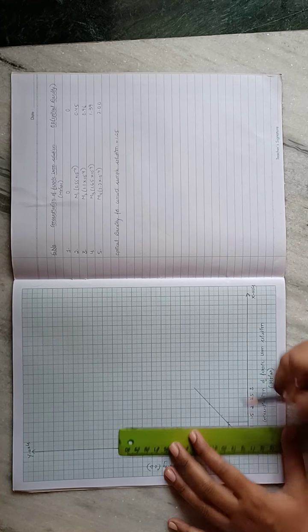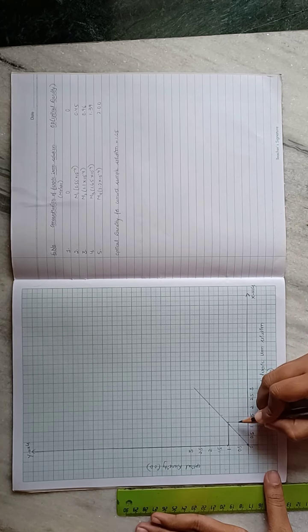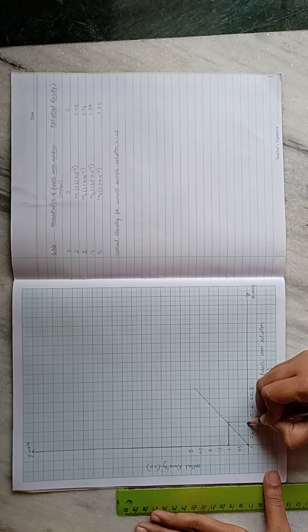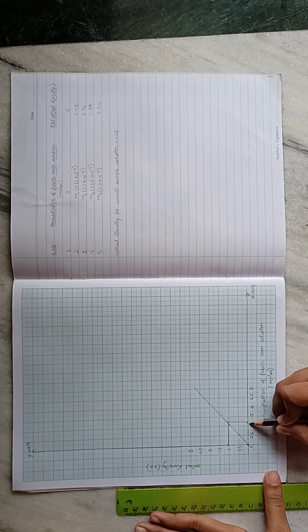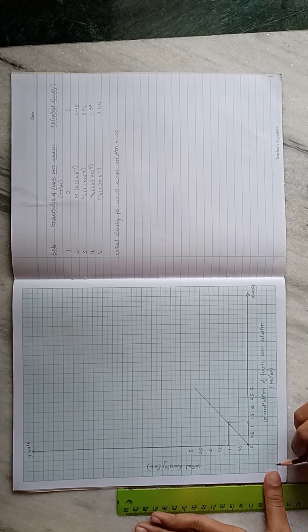And that point on x-axis is the concentration of ferric oxide present in the cement sample solution.